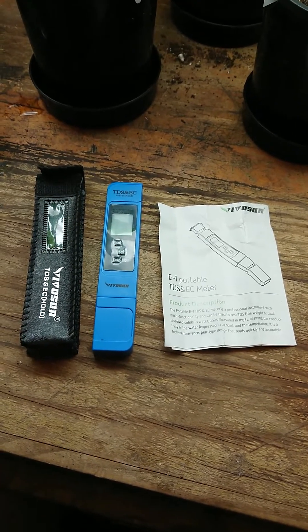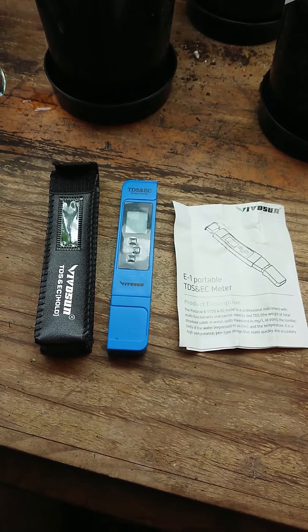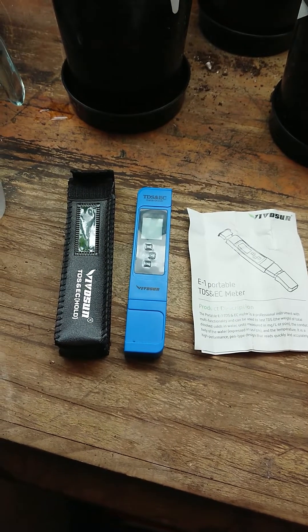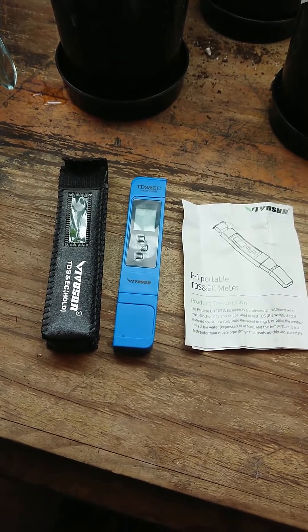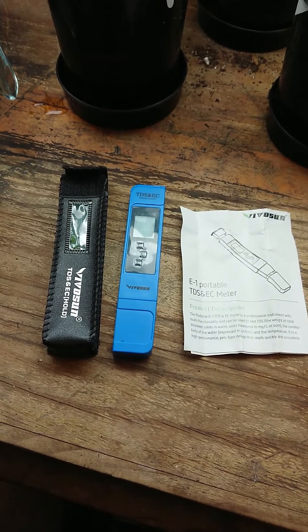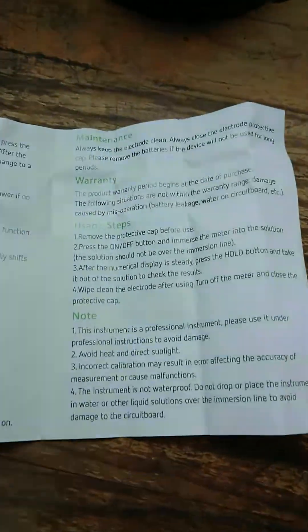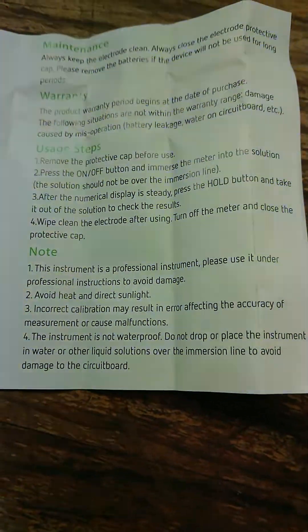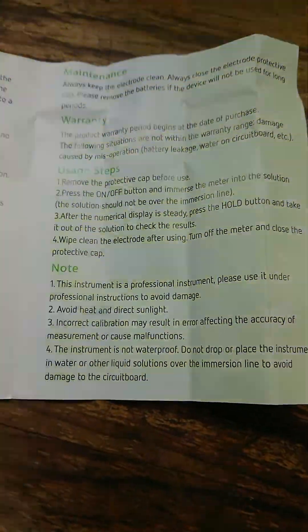In this video I'm going to show you how to calibrate the Vivosun TDS and EC meter. Vivosun don't know how to do it — they've actually claimed that you don't have to do it for up to a year, and after that they don't tell you what you need to do. They've now come out and said that this device has an auto calibration feature, which is absolute rubbish. In the instruction booklet, part 3 notes: incorrect calibration may result in error affecting the accuracy of measurement or cause malfunctions.